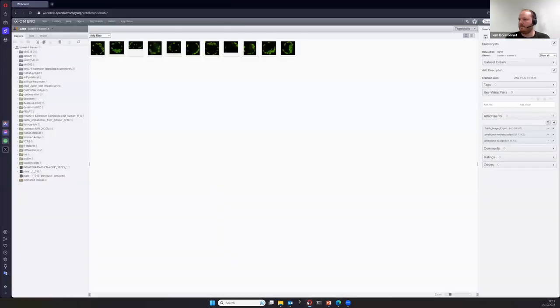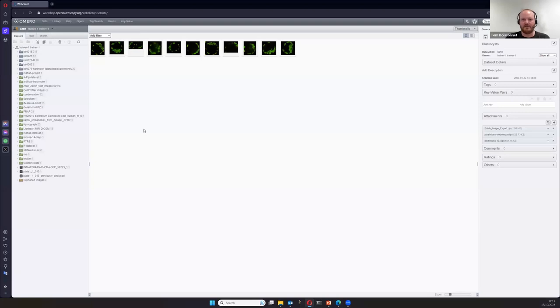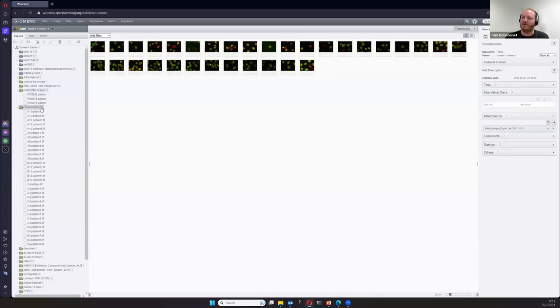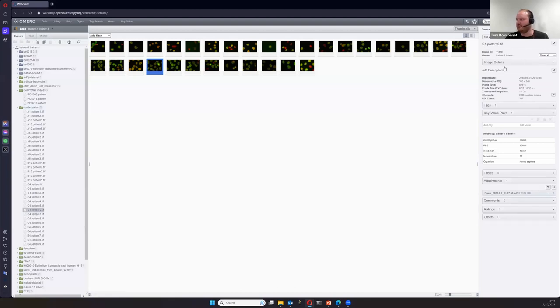Here is what OMERO Web looks like — the web interface to work with data on OMERO. On the left you have the collection of data you've imported. In green you have datasets. When you select a dataset, you get a preview of your image in the center with details on the right — dataset details or, if you select an image, the description: dimensions, pixel types, pixel size from image metadata, shape, time points, and channel names which you can edit.